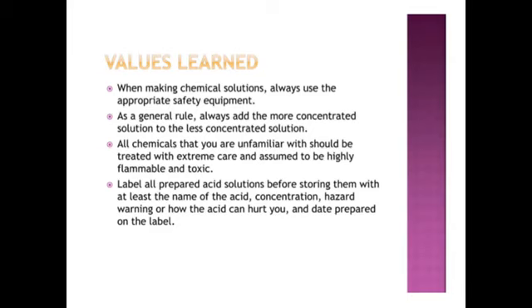Now, let's look at some of the values that we've learned. When you're making chemical solutions, always use the appropriate safety equipment. It is important that you use appropriate safety equipment. Very important. The next one is that, as a general rule, you must always add the more concentrated solution to the less concentrated solution.